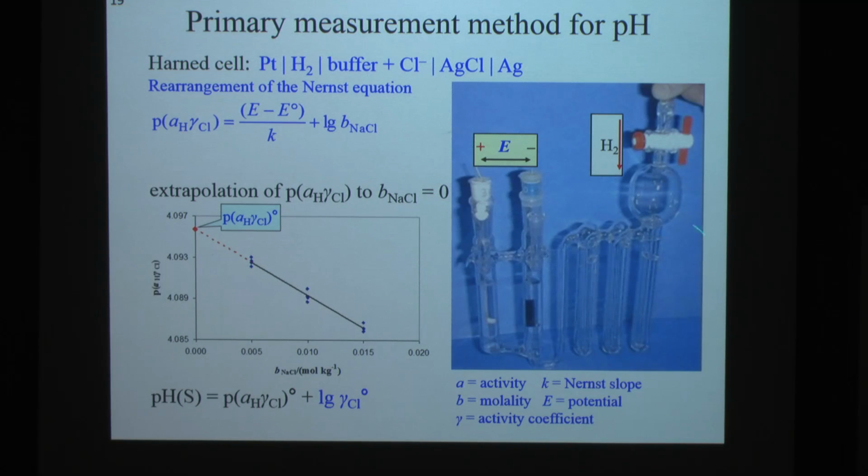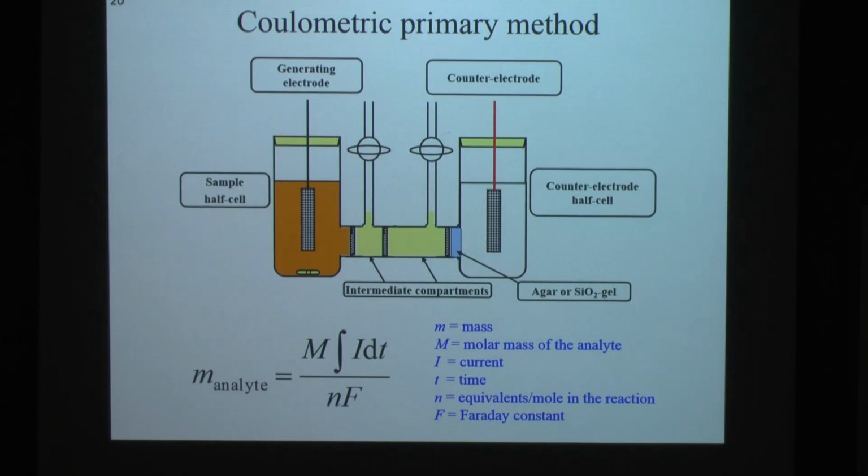So that's why for these very accurate measurements, you have to make sure that you are measuring a property that doesn't change or changes as little as possible with environmental conditions, even if it's a temperature bath. Still, the bath has an uncertainty of what the temperature is. So you want to control all the variables as much as possible. So for the E0, you need to know the moles of HCl per kilogram of solution. How do you determine that? You do it using this electrical titration called coulometry.